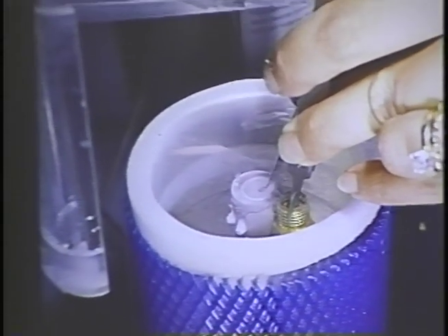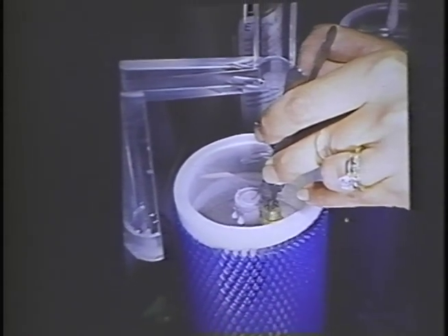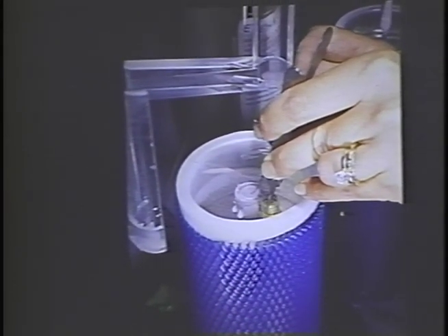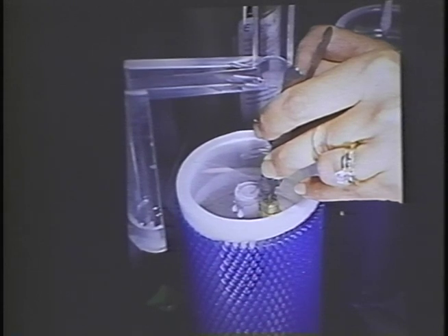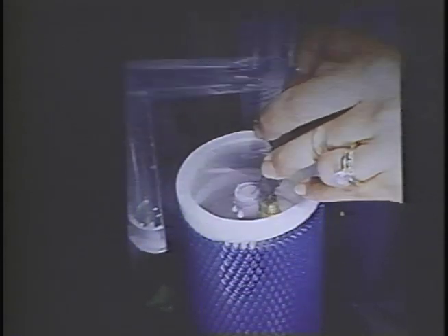The plunge freezing method has limitations in that only relatively thin samples can be cryofixed optimally. These are samples less than about 5 microns thick. So to assess the quality of freezing using the PTK cells, I then processed the grids further using freeze substitution and either embedded them for routine electron microscopy or dried them from carbon dioxide using the critical point method. Next slide.